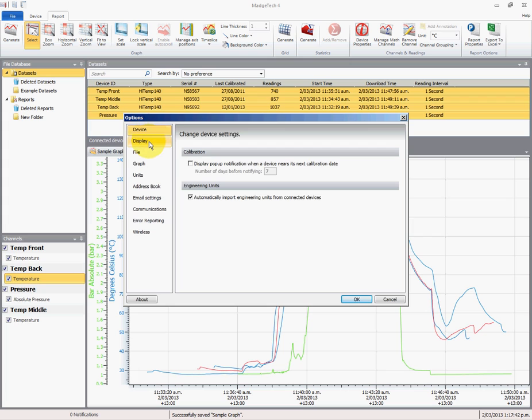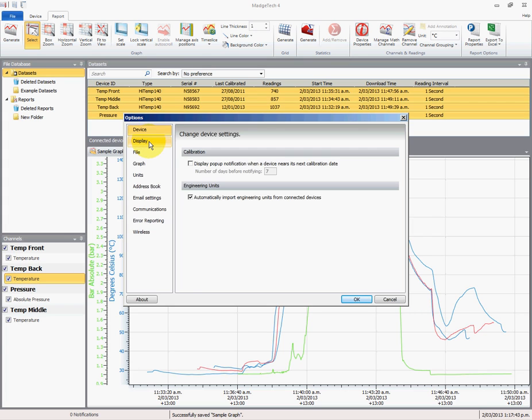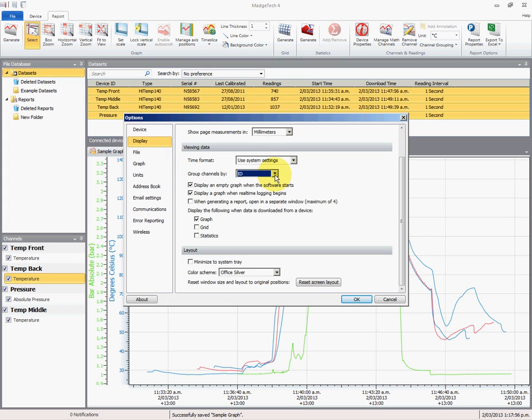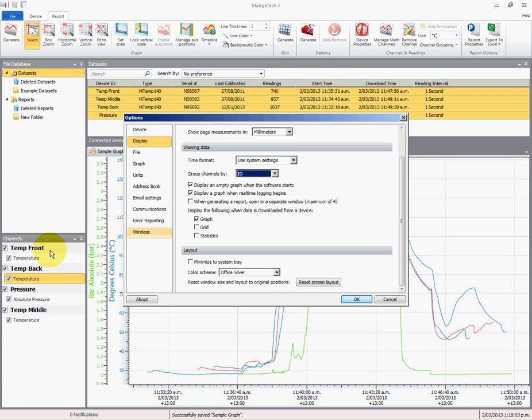Now if we go file, options, there were a few things that were happening automatically when I created it. So we'll select display. I've set this to millimeters, time format we'll leave as a system setting, group channels by ID. Now this is what we're talking about on the right hand side here—we've got these channels, and each data logger I have given an ID, and because they have a unique ID, they appear separately, and that gives me my title and the key.